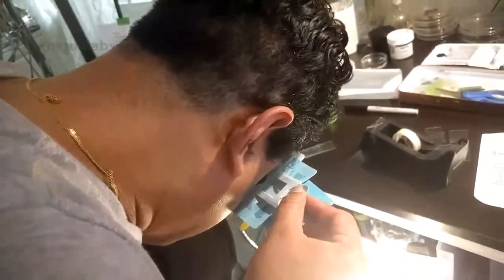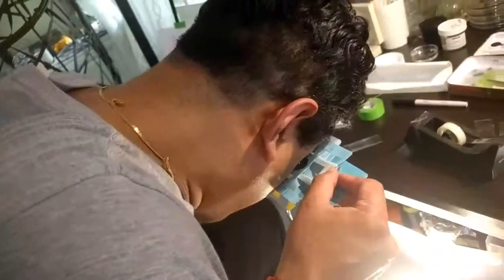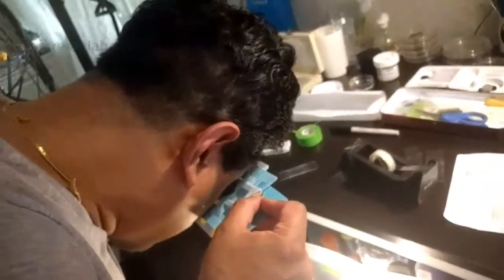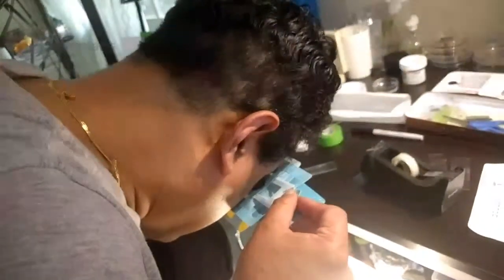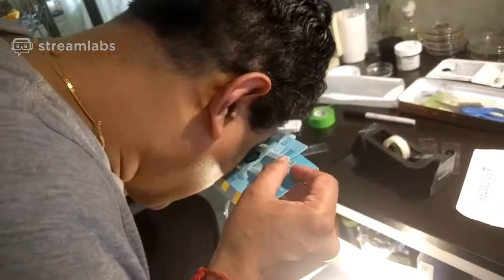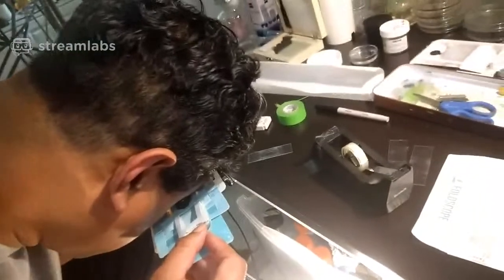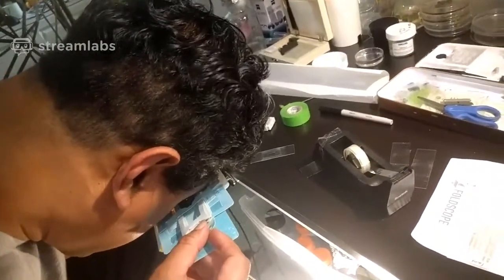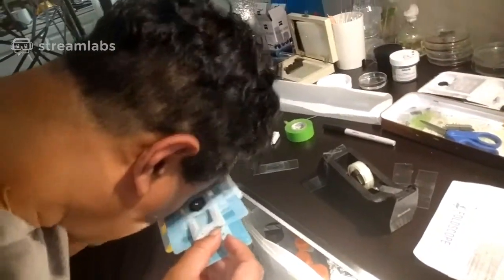Without much ado, all right. So let's try to find him. I found this in a lichen sample with great difficulty. I mean, I may have made something like 30 slides just looking. I thought, okay, I'll get him. And finally, I thought I saw him. He actually grows. This thing is a remarkable species called a tardigrade.